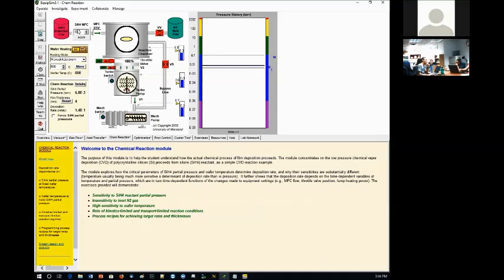Now let's see if I can put this into some saturation as well. So I will do the following. I will increase this to what? 1000. Yeah, 1000 is giving me this. Maybe I need to increase it even more.